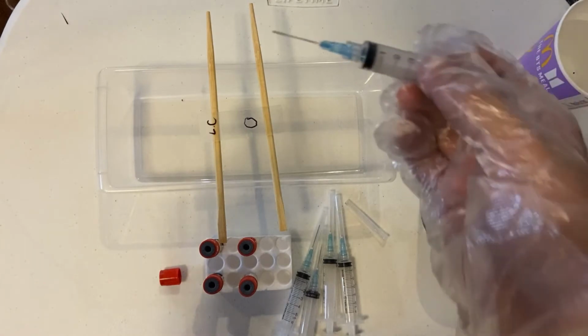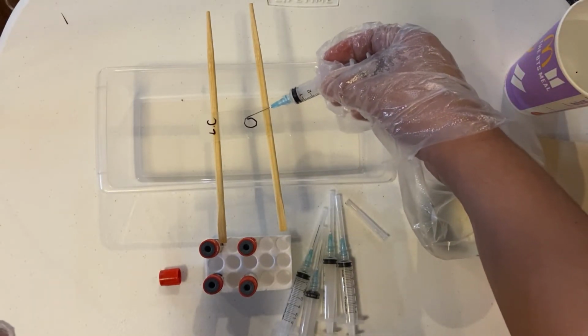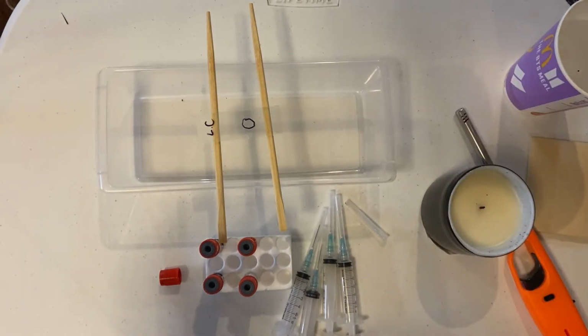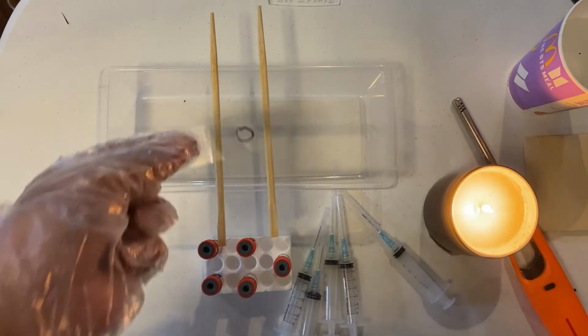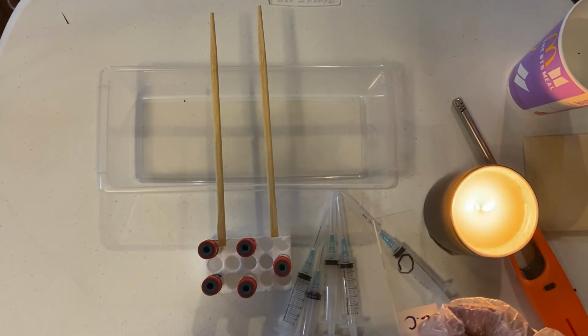When we have our sample, put it on the glass slide. Next, we will heat the glass slide. Make sure that the glass slide will not stay on the heat for too long. Make the glass slide pass through the heat 3 times.